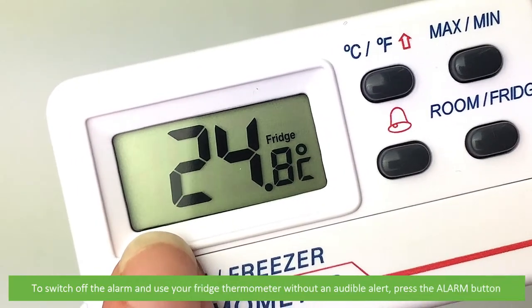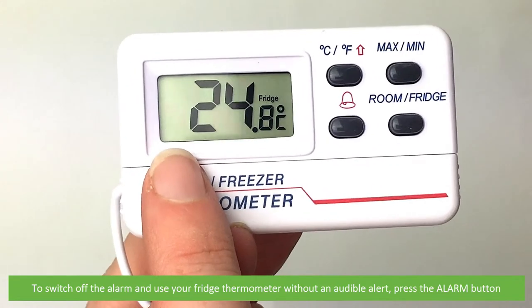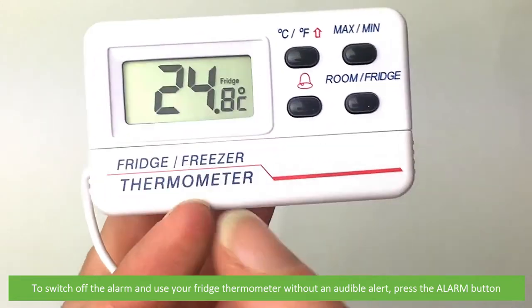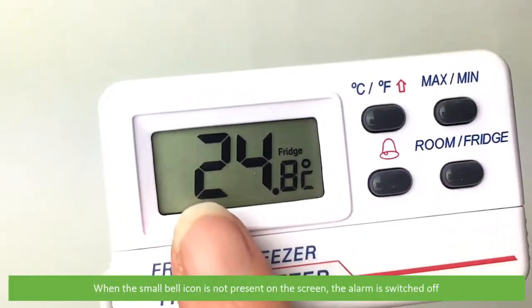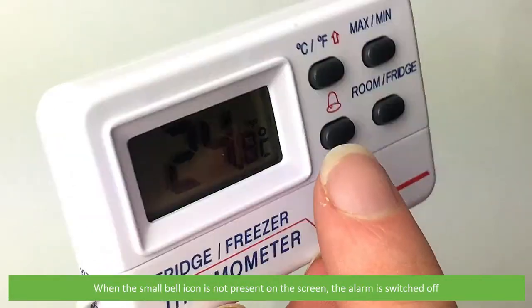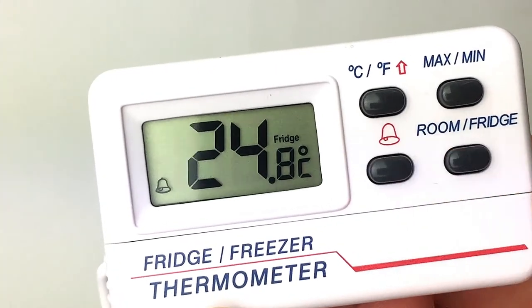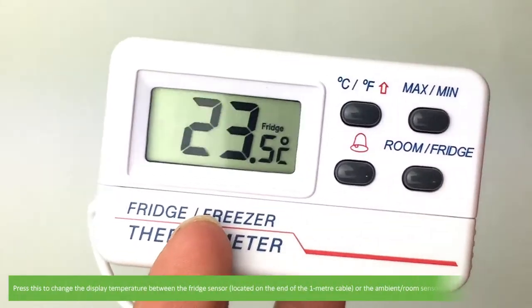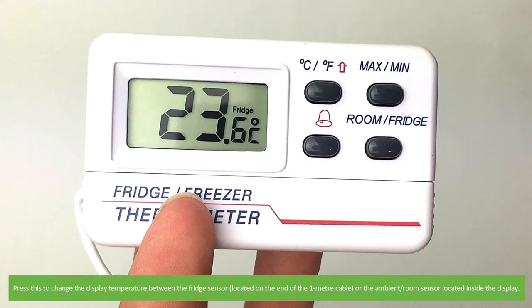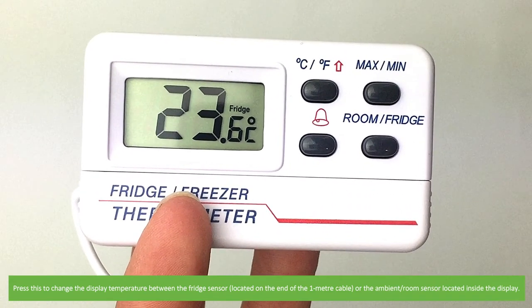To switch off the alarm and use your fridge thermometer without an audible alert, press the alarm button. When the small bell icon is not present on the screen, the alarm is switched off. The last button on the thermometer is room/fridge. Press this to change the display temperature between the fridge sensor located on the end of the one meter cable, or the ambient room sensor located inside of the display.